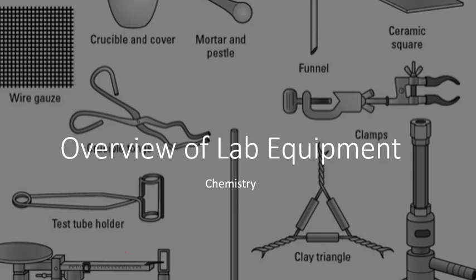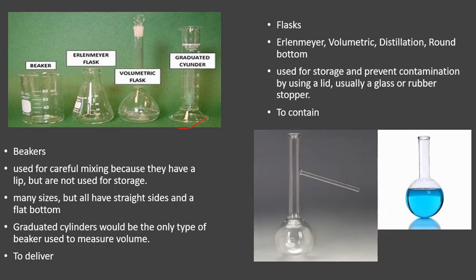Hello, I'm going to be doing a brief overview of lab equipment today in terms of chemistry lab for those of you going into your high school and college chemistry labs that need a brief summary and review of lab equipment. So we're going to start out with beakers and flasks. And yes, there is a difference.